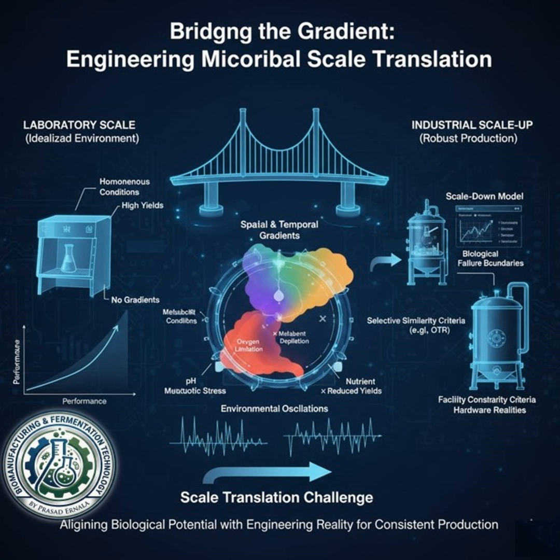Okay, cell exposure distribution. What does that mean in practice? It means we're moving past the averages and focusing on the microbe's actual experience. What matters is the amplitude and the frequency of stress, those quick drops in dissolved oxygen or pH or substrate, and crucially, how long the cells are stuck in those bad zones. That feels like a huge paradigm shift. And if the average set points are misleading, what does that say about the role of the pilot scale? Because that's always been seen as the final proof.